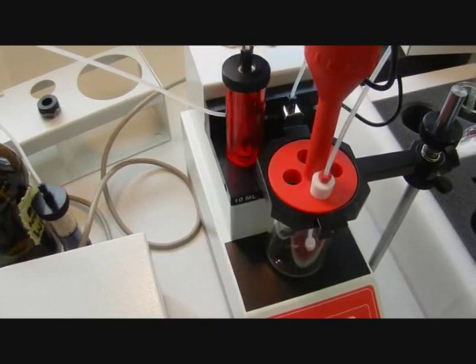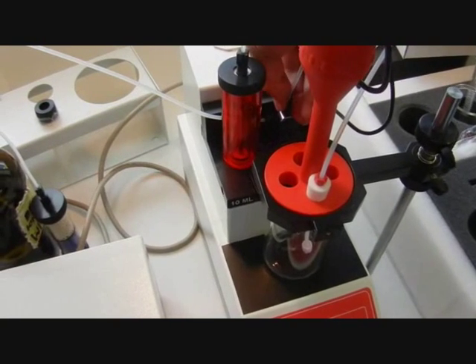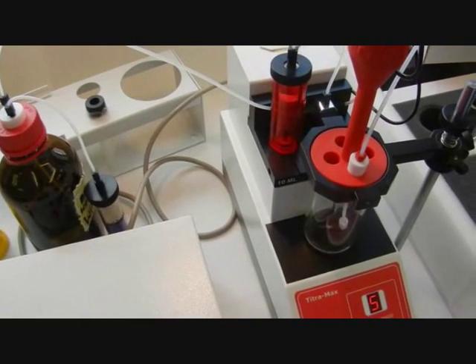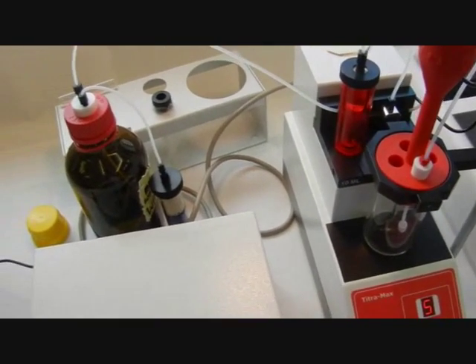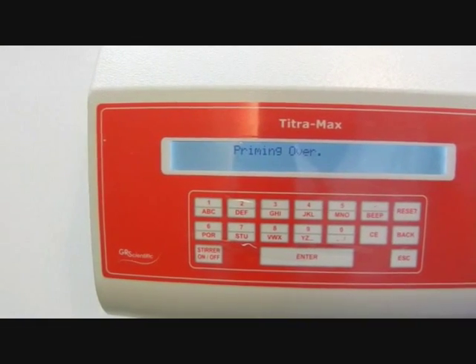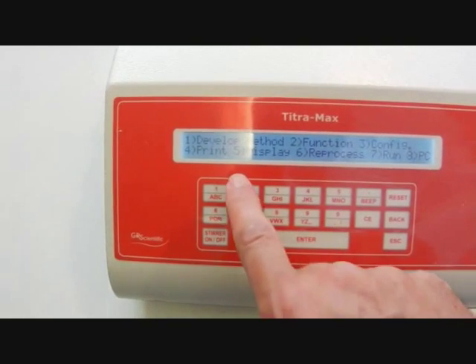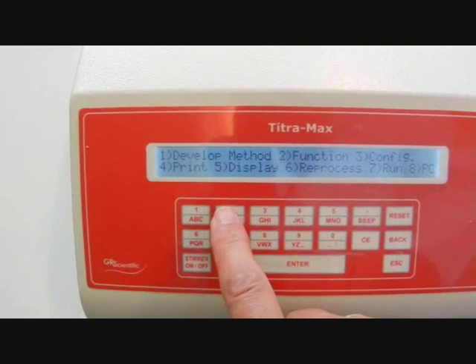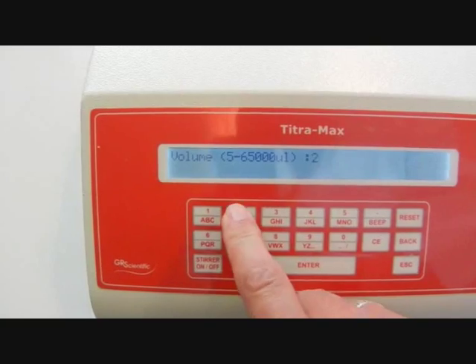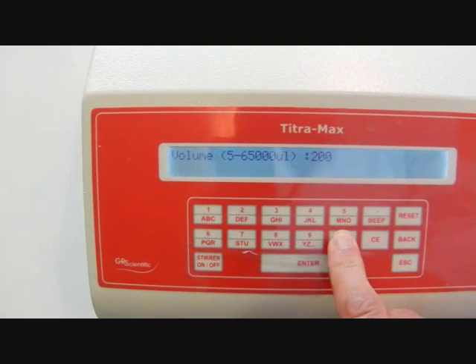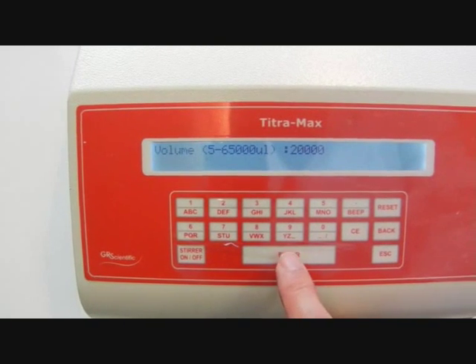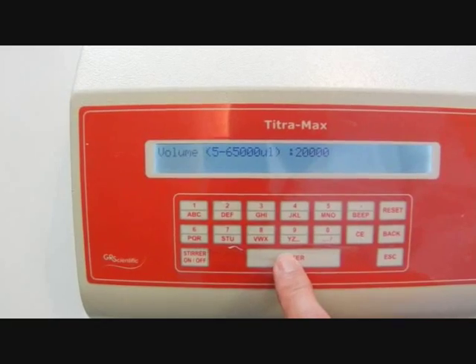Now whilst that's doing that, check all the tubes going in and out of the switching valve to make sure there are no leaks and also check the top of the burette. If you're happy that there are no leaks, the unit can be primed further just to make sure there are no air bubbles. Select 2 again function and then select 3 prime. This time we'll select 20,000 microliters to give 2 10ml flushes of the system. That should be enough to make sure there are no air bubbles.